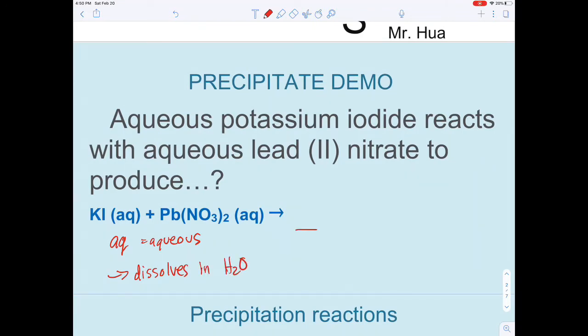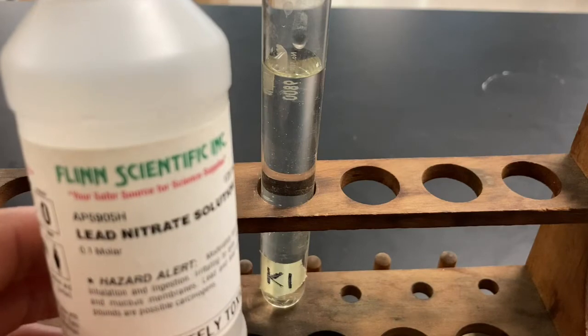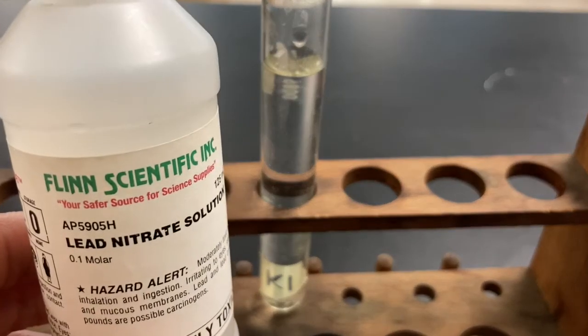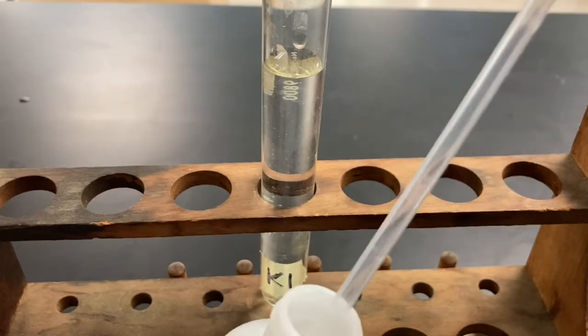We'll see what two products are formed. Here I have my aqueous potassium iodide, and to that I'm going to add some lead nitrate which you see here. Let's see what happens when these two chemicals react.